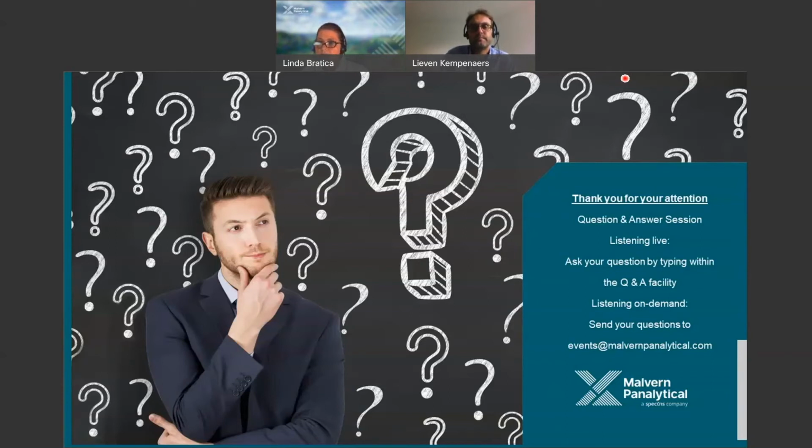Thank you. And now I think it's more a comment than a question. It's better to use WD-XRF than ED-XRF for more sensitivity for some elements. Yes, for the light elements. If we're talking about magnesium, aluminium, silicon, sodium, then WD-XRF is a better method to use than ED-XRF. Yes, that's correct. And therefore, is it more convenient to use WD-XRF in the pharmaceutical industry to have more sensitivity, correct?